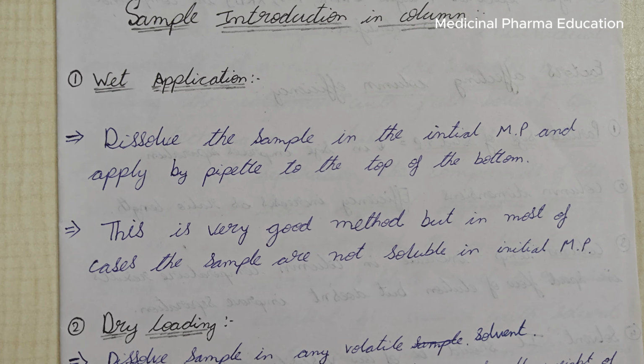This is a very good method, but in most cases the sample is not soluble in the mobile phase. That's the major problem.